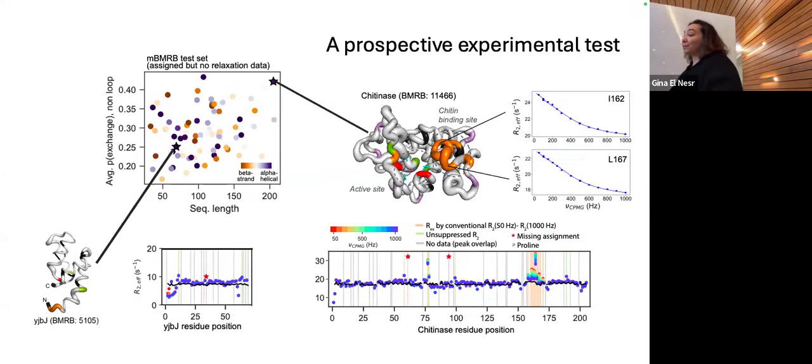Could your model, if you apply it to as many proteins as you want that are, let's say, 300 residues or less in all these sequence databases, rank and prioritize which ones we want to get really good dynamical data for? And let's just get an NMR spectroscopist like Hari some money to collect the data for the structural genomics dynamics data sets that we need for training better models. Is that a crazy idea?